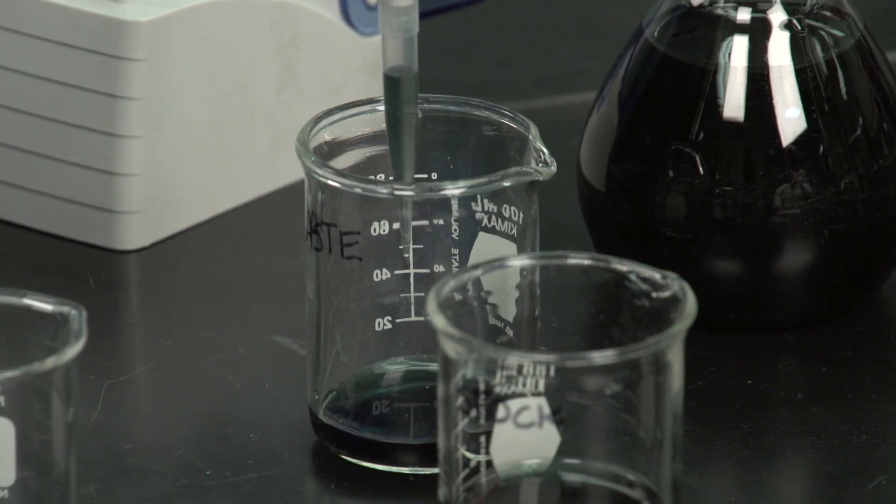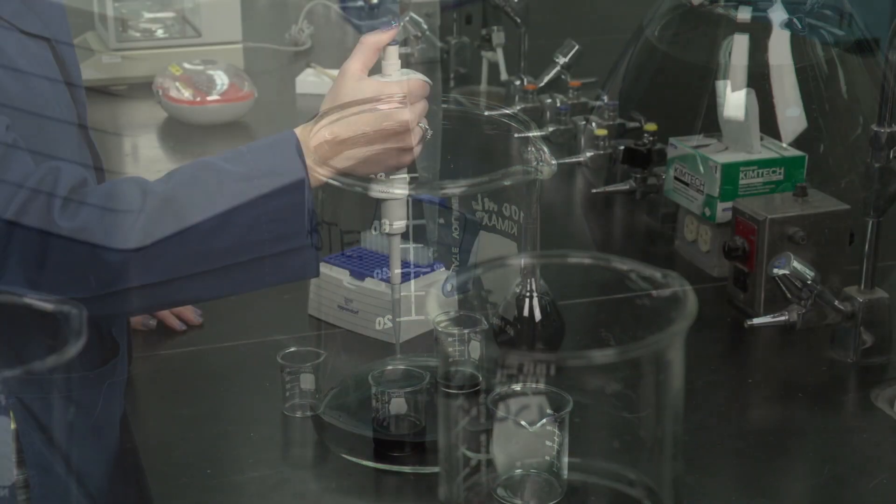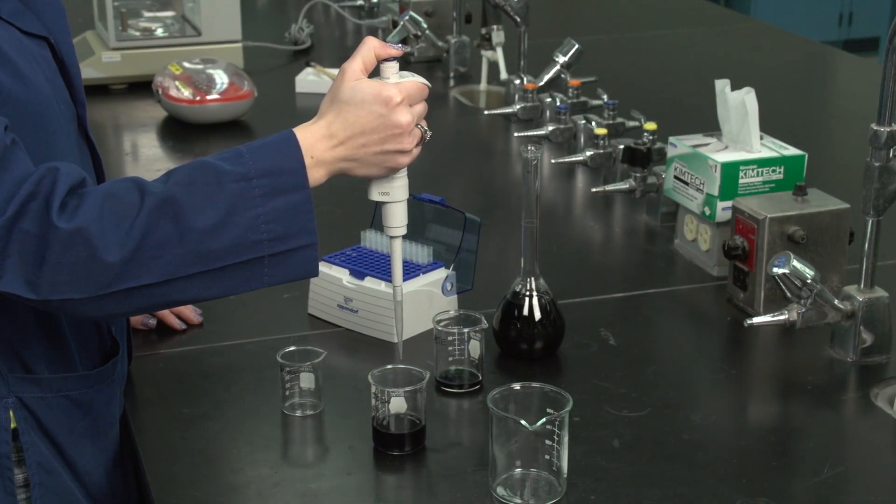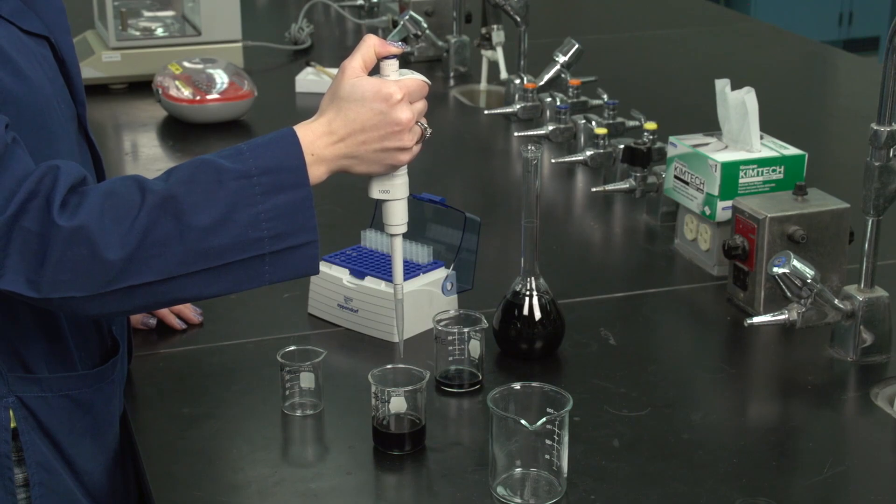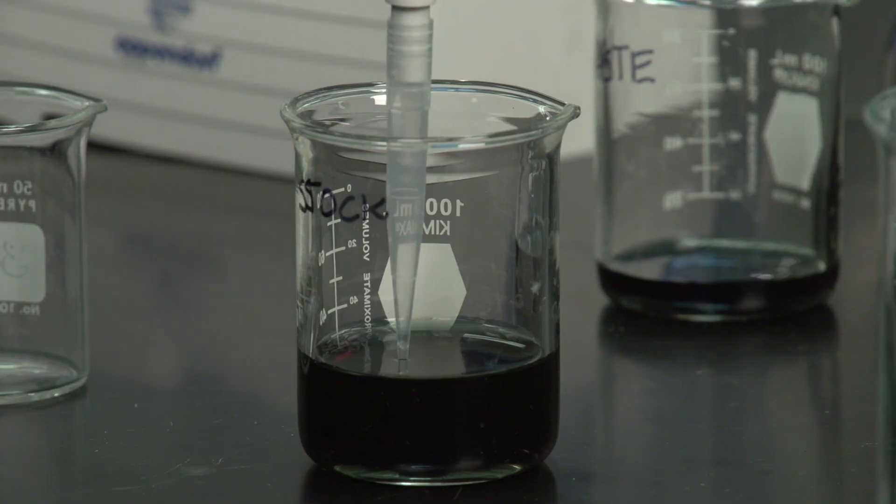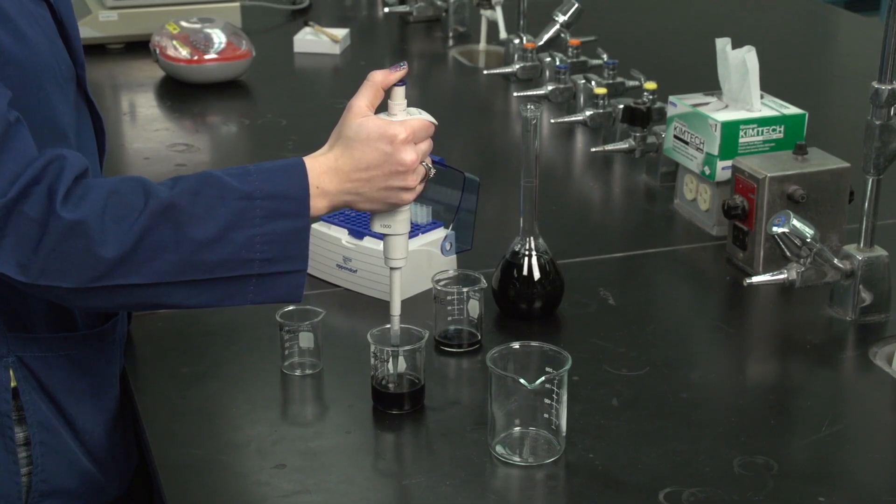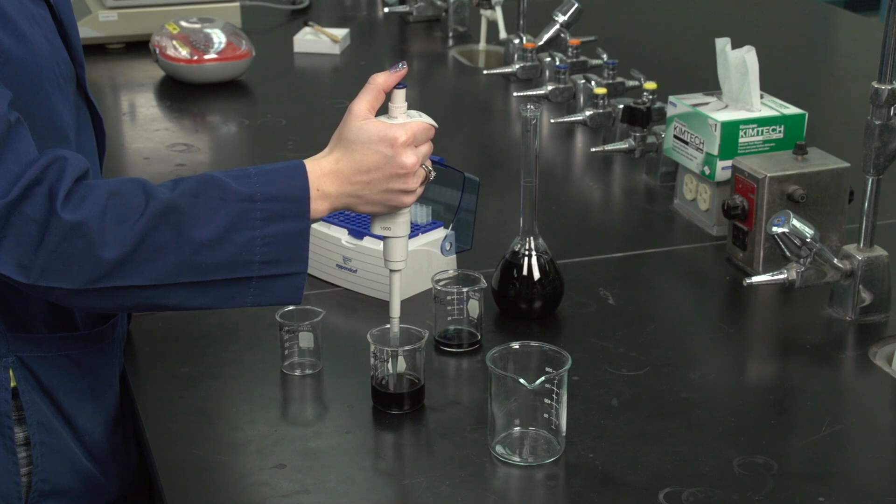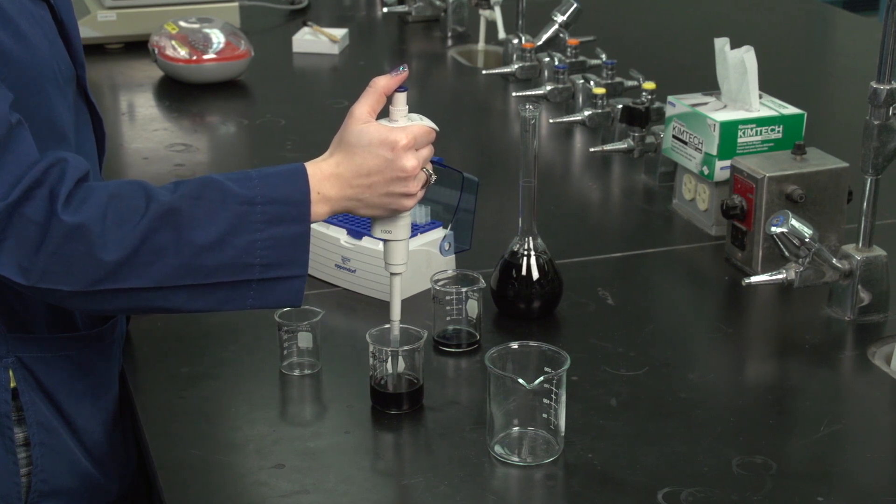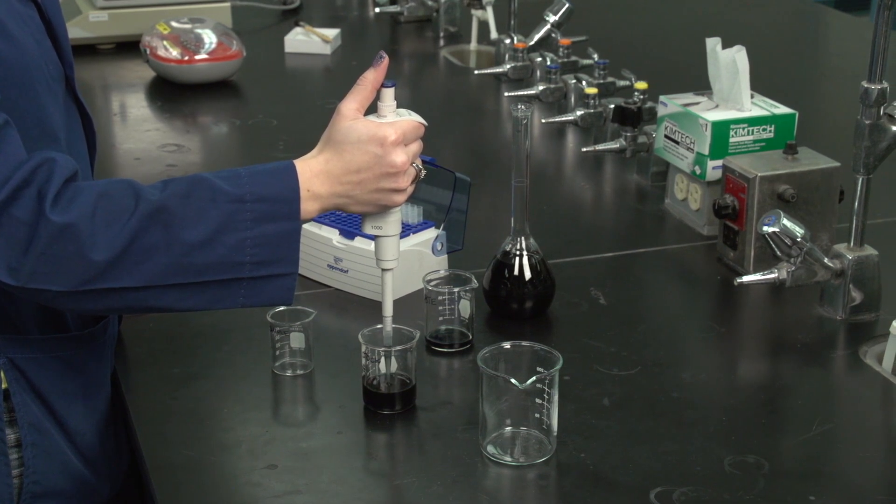You are now ready to transfer liquid using the micropipette. Depress the plunger to the first stop. While holding the pipette vertically, immerse the tip approximately three millimeters into the sample solution. Smoothly return the plunger to the initial position, allowing the sample to enter the tip. Do not allow the plunger to snap back to the initial position.